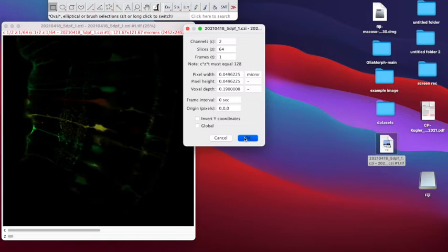The frame refers to the point in time where the image was taken, and this was a single frame image, so taken at one moment rather than throughout time. And the dimensions of the voxel that we can see here are width, height, and voxel depth. Due to resolution limits, voxels are typically longer than they are tall or wide. Therefore, they have a rectangular shape. In this case, it is important to check that these rectangular dimensions are maintained and they do not have a falsely cuboid appearance where height, width, and depth would be the same.